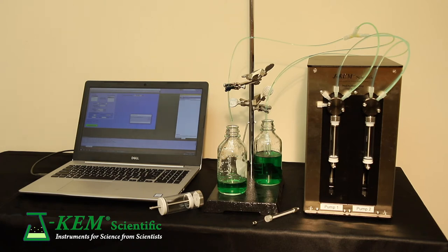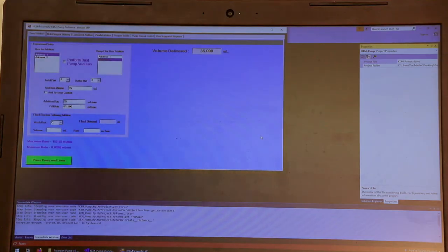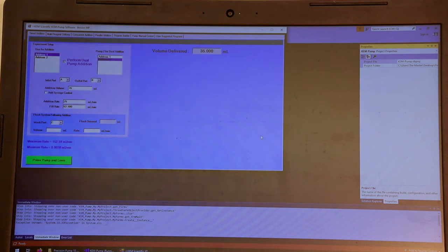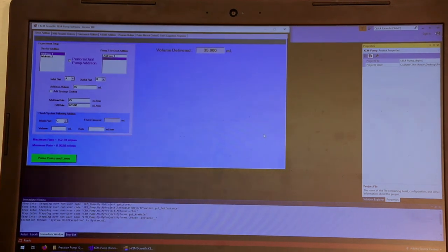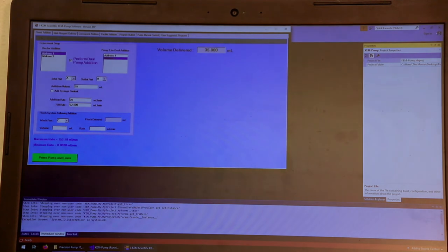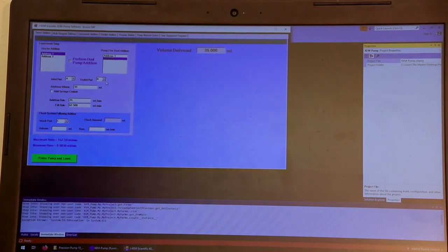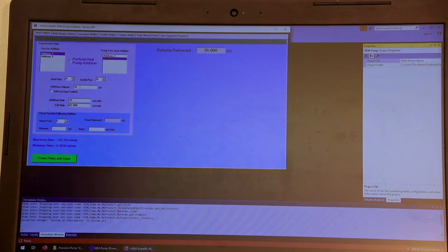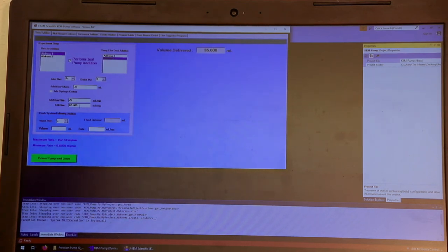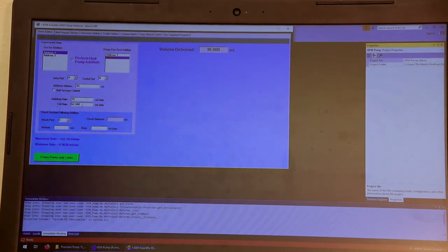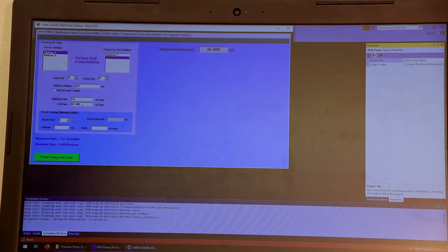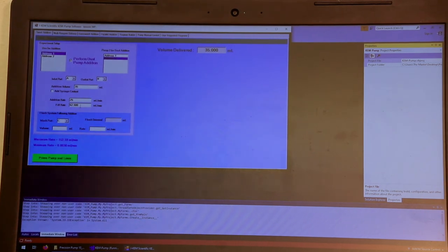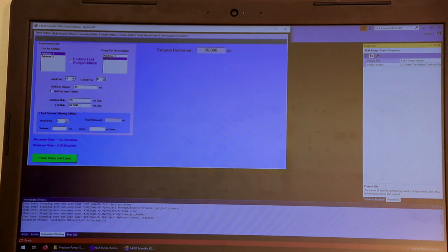And now I can focus on the software portion. There are certain standard programs. This very first one is a timed addition, and that was the program that I was running. So in the timed addition program, you can say what your inlet port is, and I could have picked any of my eight ports. You specify what your outlet port is, you enter the rate of addition, and then the total volume that you want to add. You can also enter a fill rate. Most of the time, fill rates aren't important if you're using just a standard aqueous organic reagent. But if you're using something very viscous, like a monomer, then you can enter a fill rate low enough that the syringes fill appropriately.